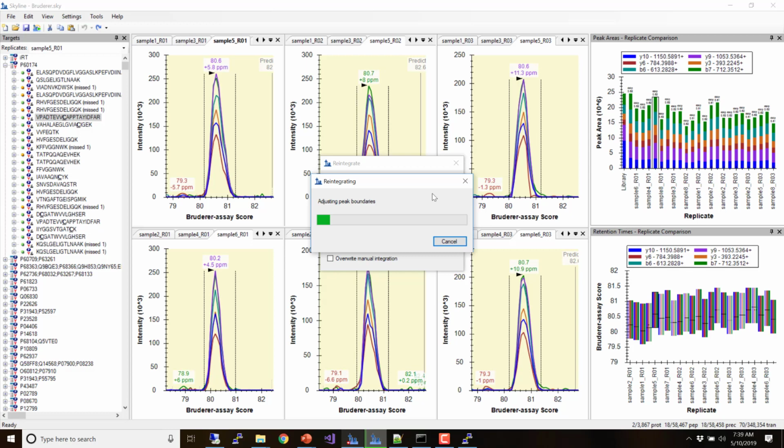Go ahead. Yeah, integrate all peaks, not only the significant ones. Yeah, because MS Stats will deal with the Q values, the assigned Q values. If you had a statistical tool that you were less sure of, basically choosing the significant ones allows you to make things missing values, like just completely missing values, and that can have an impact on the statistics. But MS Stats will deal with our Q values just fine, so we leave everything.